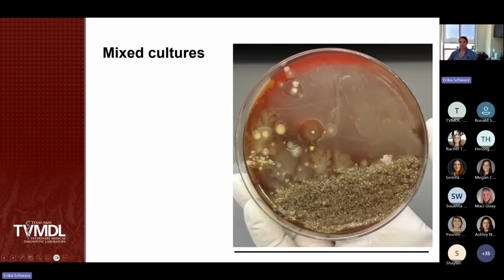The next picture, this one is a lung culture, also was in the lab yesterday. Notice how you have lots of different colony types, including some of that swarming morphology, probably a combination of both Bacillus and Proteus that are swarming in the plate. This would be suggestive of a possible contamination. Since it's a lung culture, it's very possible this animal was dead longer than 4 hours before this was collected. But there are many different colony types, and all of them extend into the fourth quadrant. So this is a good example of what we typically see with older tissue samples when we're getting postmortem invaders.